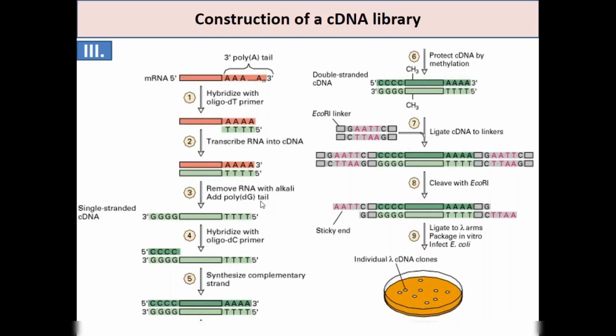It's not like that, Anushka, because as I told you, RNA is more unstable when compared to DNA. So when I add NaOH, it will be degraded very fast.